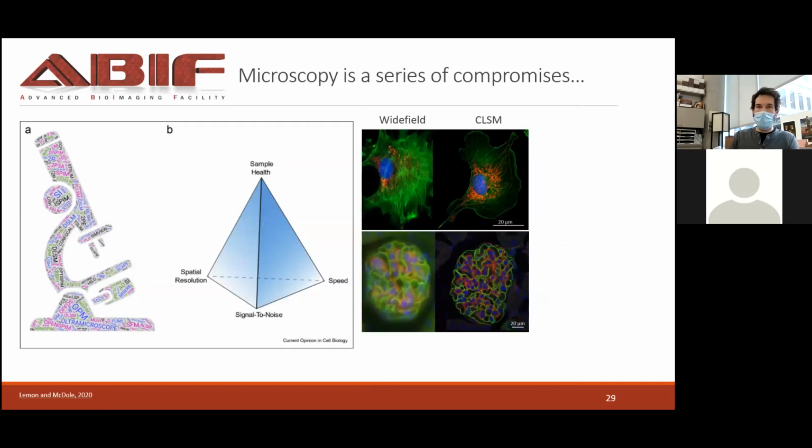Again, I hope we drove home a little bit how the pinhole works, how you have quite a flexibility in terms of the scanning geometry, and hopefully how that will modulate the quality of the images and the quality of the information that you can get out of it.